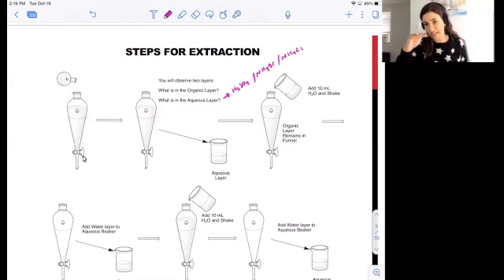You'll be able to see the separation between the oil and water clearly with your naked eye, and you'll be able to drain the aqueous layer away from the organic. The organic layer is then typically washed a couple of times. The washing refers to the addition of some extra water, shaking of the separatory funnel, and allowing the two layers to settle again, and collecting the aqueous layer and adding it to our initial water collection.